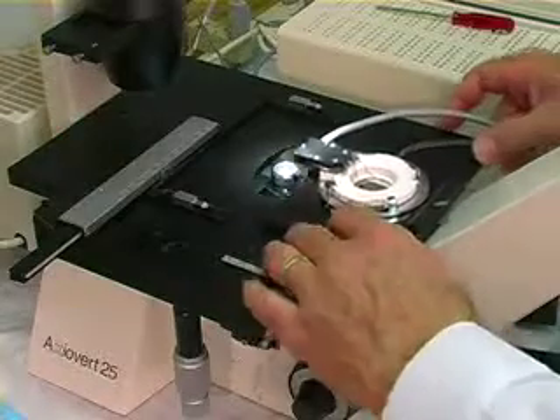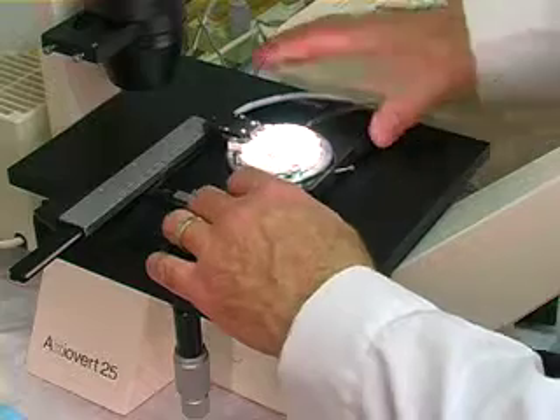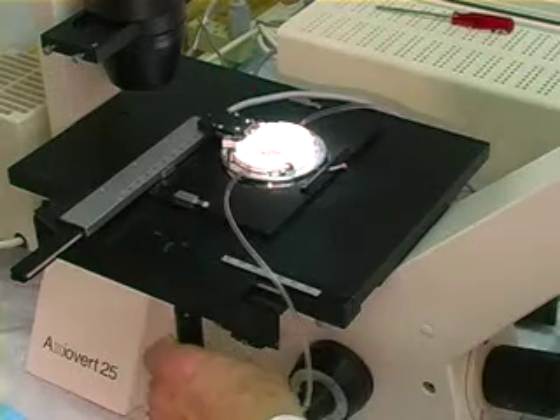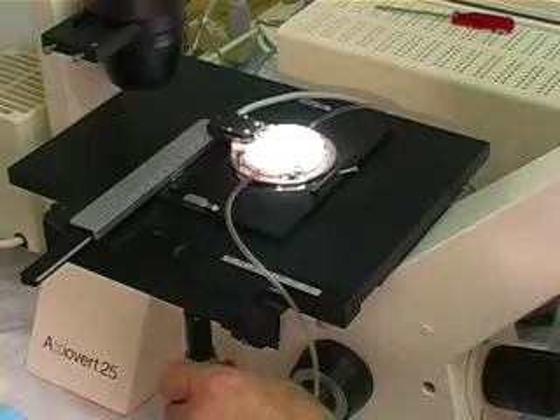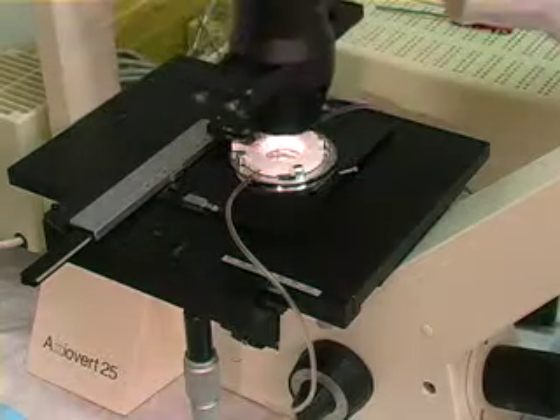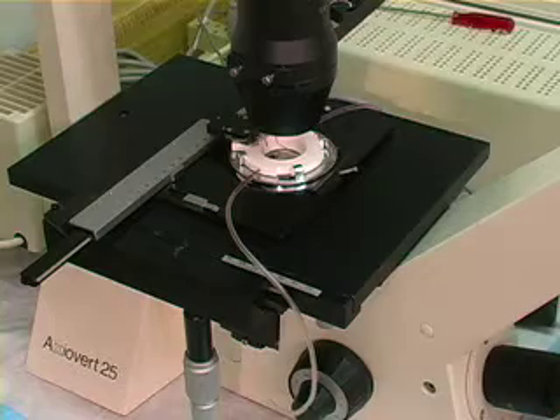The FCS-2 also requires a stage adapter for precise positioning. Due to the diversity of microscope stages, it is necessary to determine the correct adapter by identifying the brand of your scope, the manufacturer's stage identification number, and a description. Some of the options available include a special chamber made for TIRF applications and single-molecule fluorescence.